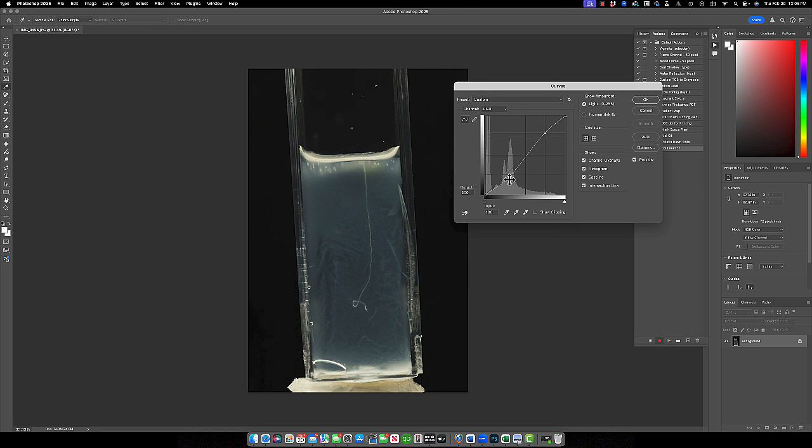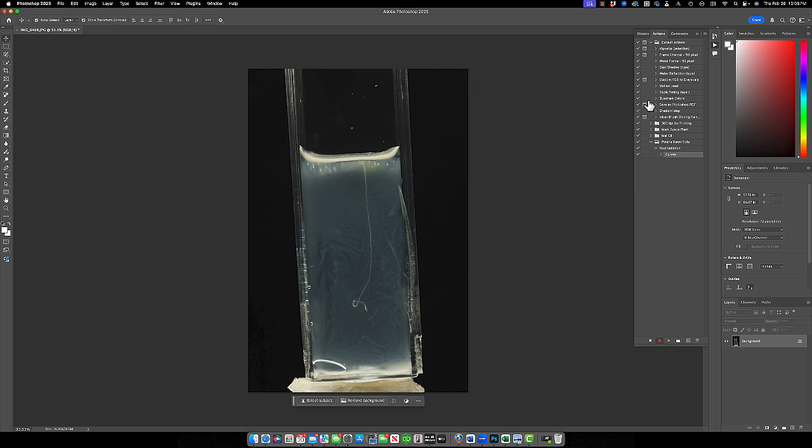We could also probably try and create a negative or even just work off of a black and white image and then hyper contrast this thing just to isolate the root. But I'm worried about other cuvettes where there might be much more faint root structures that are popping off that we might start to overprint. So we want to be dramatic, but we also want to be subtle so that we're not actually eliminating information that's quite valuable.